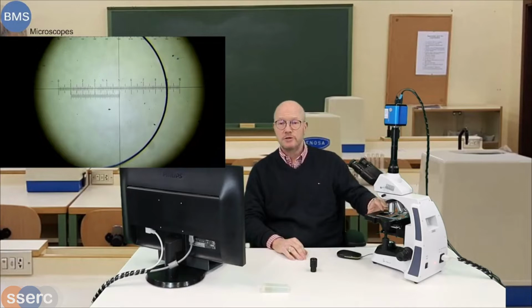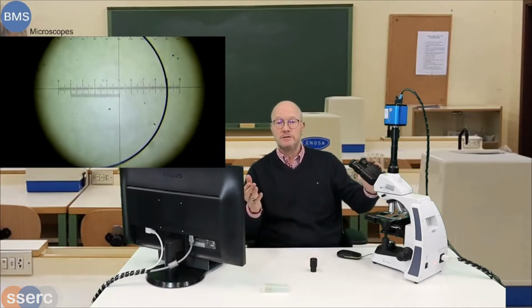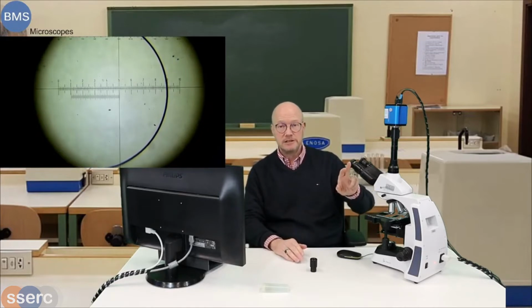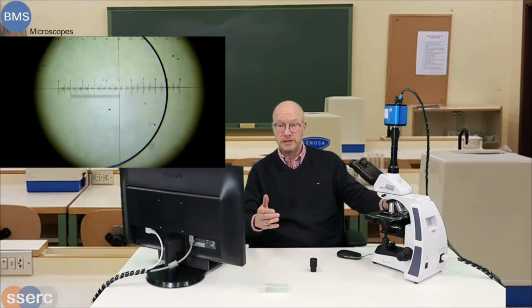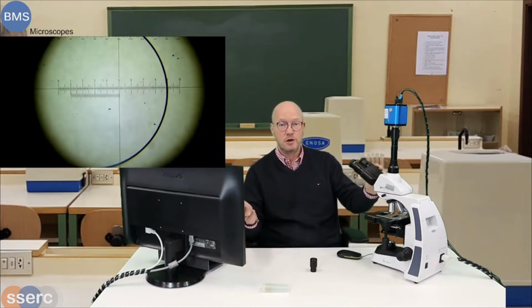If you have a 4 times objective and a 10 times eyepiece, together you get a total magnification of 10 times 4, which is 40 times. With the 10 times objective and 10 times eyepiece, you get 10 times 10, a total magnification of 100 times. With a 40 times objective and the 10 times eyepiece, of course, you get 400 times total magnification.